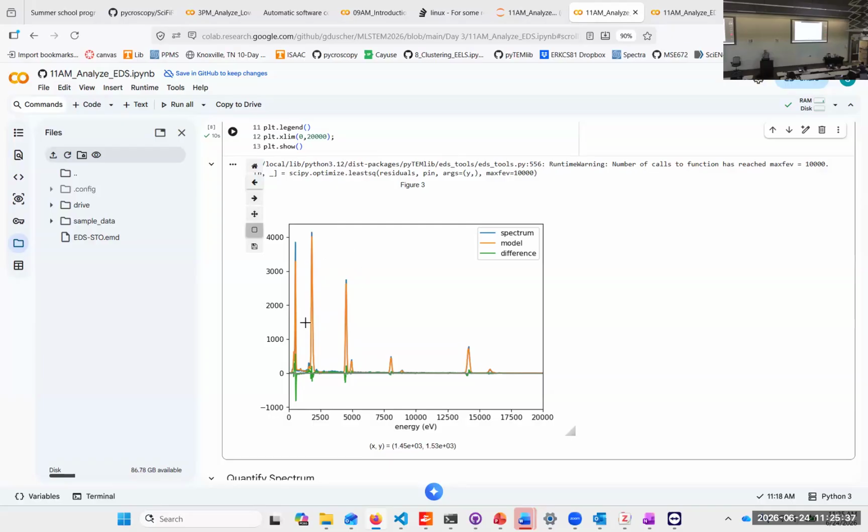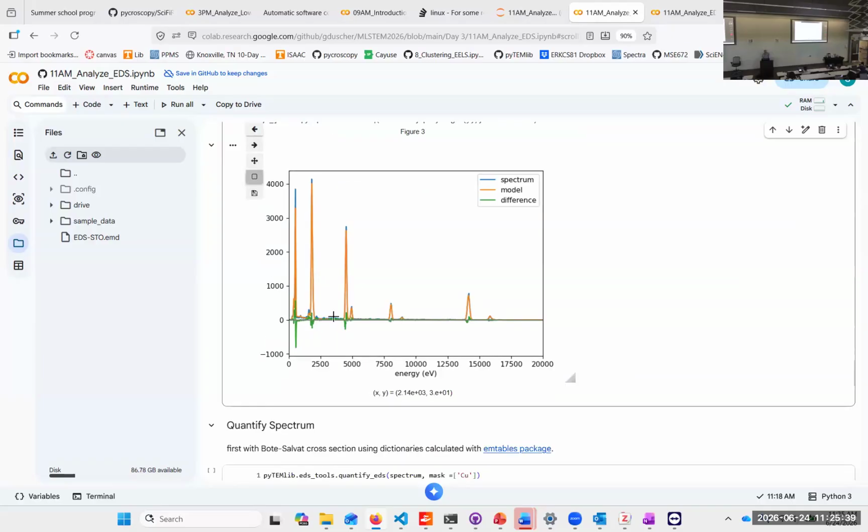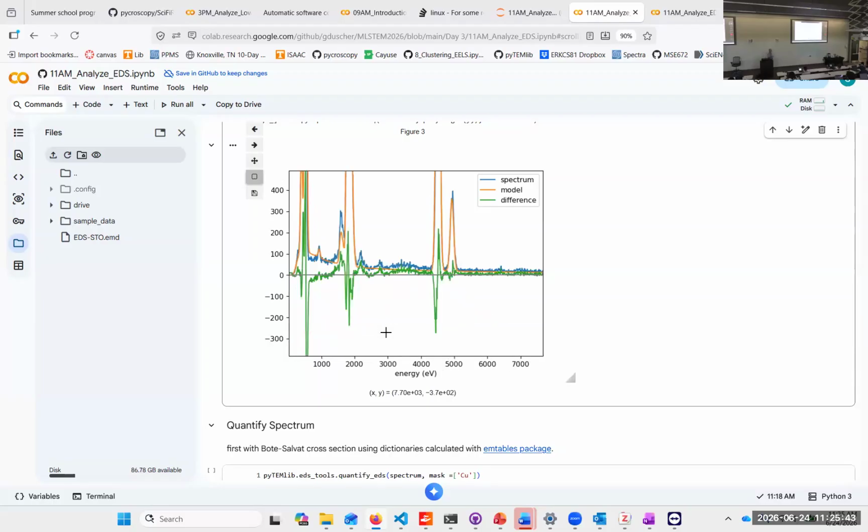So I don't have to do anything else on that. And I get even an error because I can just subtract the two things. And I know for each single family what is the possible error in my quantification. Because I have a model, and that is the key thing in the model, that you're not only getting your quantification, you get your error because you can subtract the model from the spectrum. Okay.